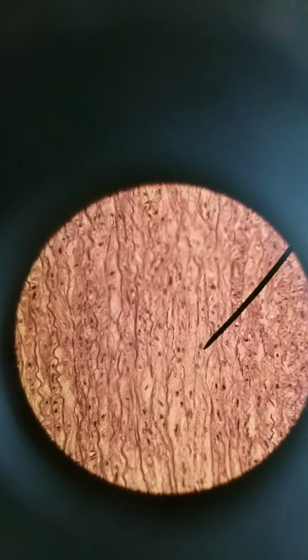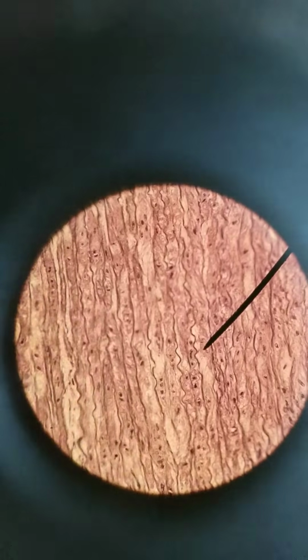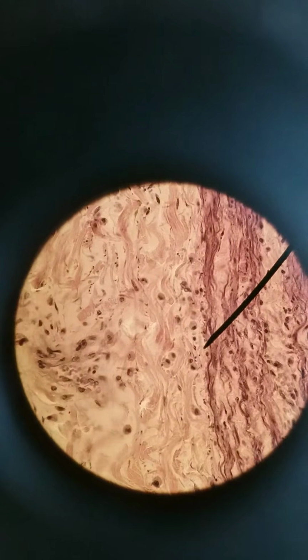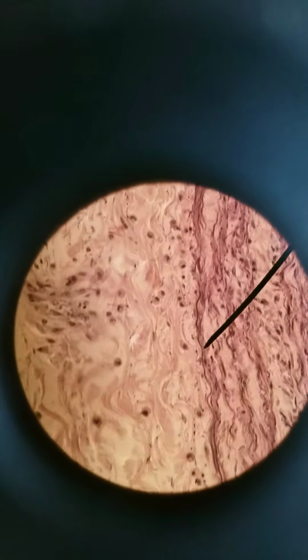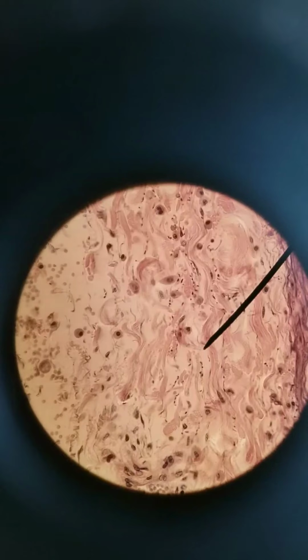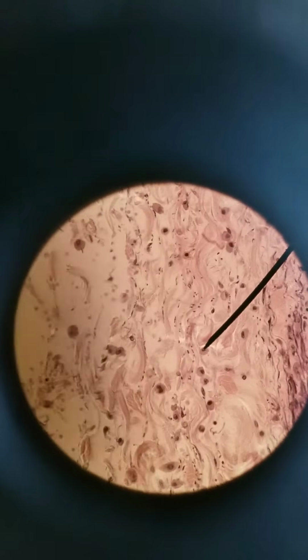Tunica media is a mix of smooth muscle, so those are the long cells, and then the squiggly lines, that's elastic tissue. Tunica media has smooth muscle and elastic tissue. We keep going, and then we start switching. Here's this last squiggly line. That's the external elastic membrane. It's the end of tunica media. And then now we're getting to the dense irregular of tunica externa, the adventitia. You can see the banding of the collagen here.